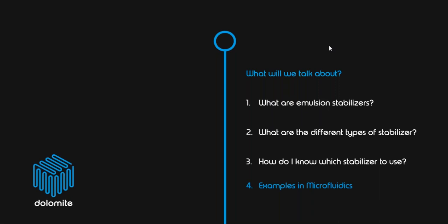Depending on what your application is, there are a couple of different options for how you might stabilize this emulsion. For things like single-cell analysis, it can be really important to prevent droplet-droplet crosstalk. If you're trying to isolate individual cells and understand them in isolation from one another, the last thing you want is, after you've lysed them, for the proteins to start transferring between the droplets via the continuous phase. So in this instance, Pickering emulsions, as discussed, create a nice strong barrier to prevent molecules from entering or leaving the droplets, which can be really useful.